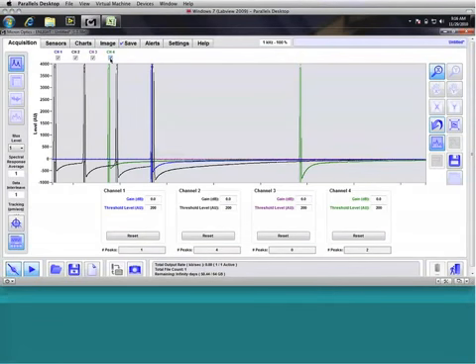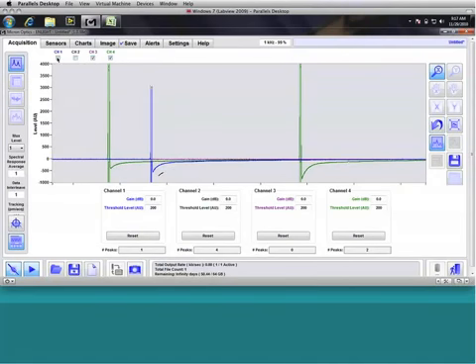If we want to speed up our data display to do some diagnosis, we can turn off the channels that we're not interested in, and then we're going to get a much faster response. I'm not sure if that comes across the WebEx demonstration or not, but here we get a much more dynamic and live response. So with that view, let's zoom in on one of these sensors.